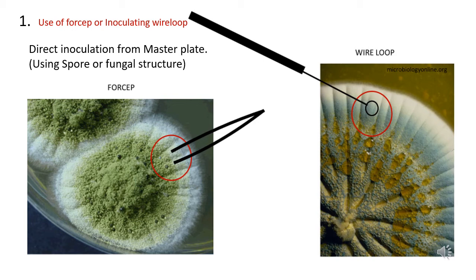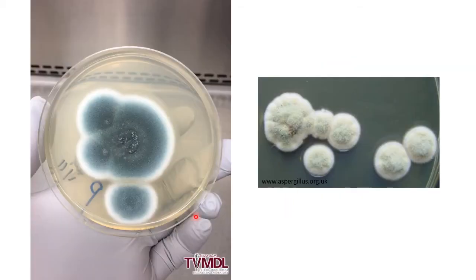The first technique you can use is a wire loop or a forcep. You can directly inoculate some part from the master colony to your subculturing plate. From the master plate you can pick up fungal fragments or a small amount of fungal spores and directly inoculate into your subculturing media plate. You can also use a wire loop to inoculate directly from master plate to subculturing plate.